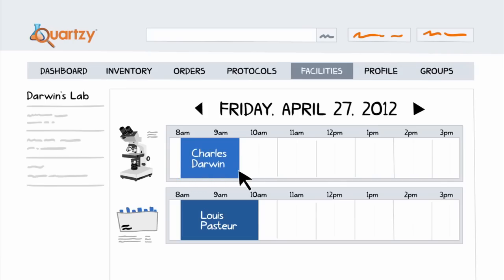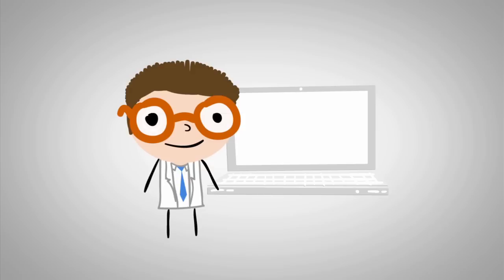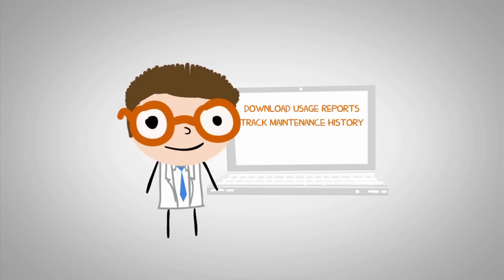And thanks to Quartzy's intuitive scheduling module, everyone will be able to see equipment availability from a shared online calendar. All sign-ups are recorded, so you can download usage reports, track maintenance history, and much more.